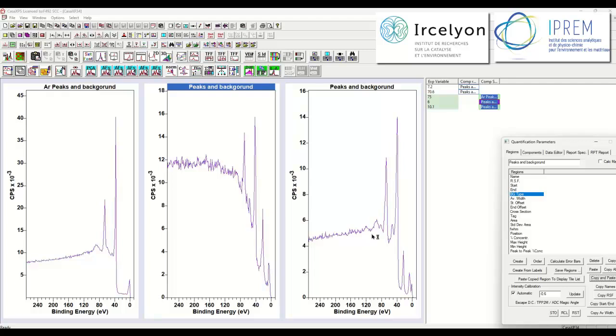The oxide, on the other hand, may represent oxide in terms of the proportion of photoemission signal between vanadium and the oxygen, but the background, it's possible that this is including some component of signal that would have arrived in the background as a result of a substrate that is metal.